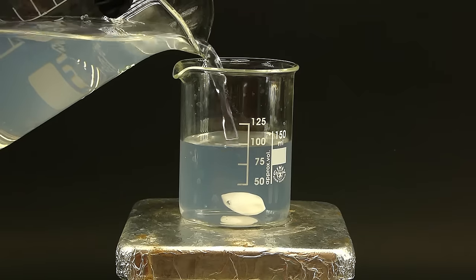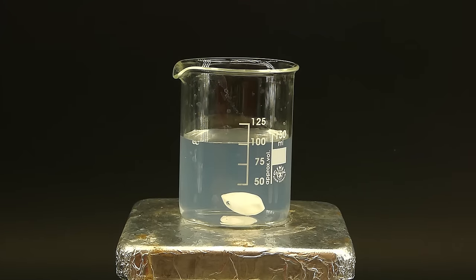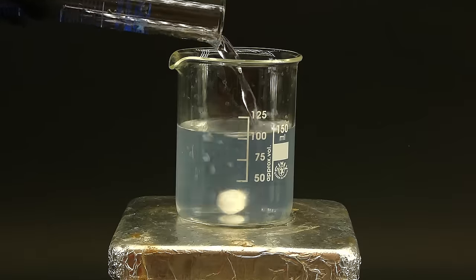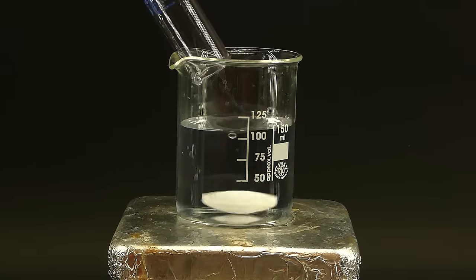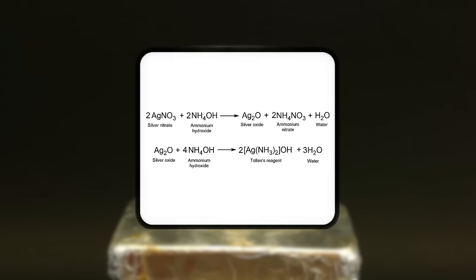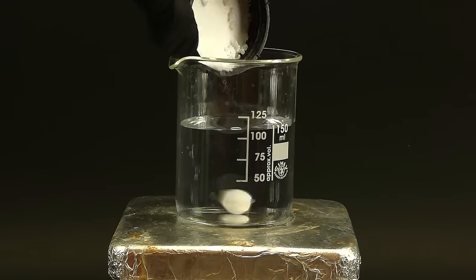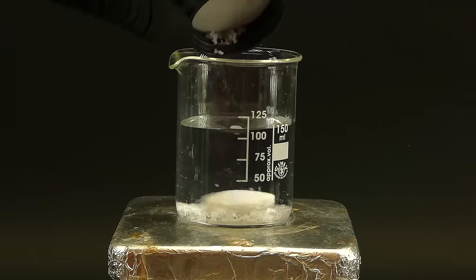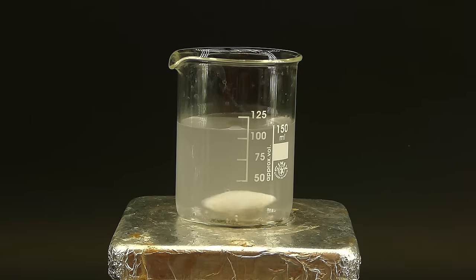I got about 100ml of the silver nitrate solution into a small beaker, and to turn it into the Tollens reagent, I added in 7ml of a 23% ammonia solution. The ammonia reacts with silver nitrate, producing silver oxide, which then immediately reacts with more ammonia, forming the Tollens reagent, and somehow making the cloudiness go away. After adding the ammonia, I also added 1.8 grams of sodium hydroxide, to keep the pH basic, which is crucial for the mirror to form.